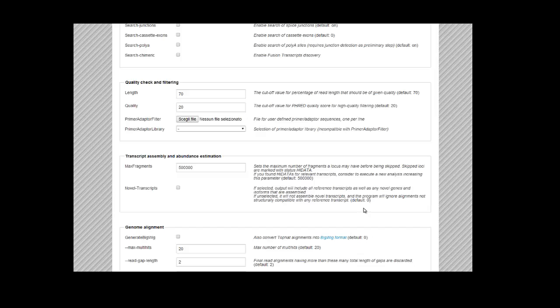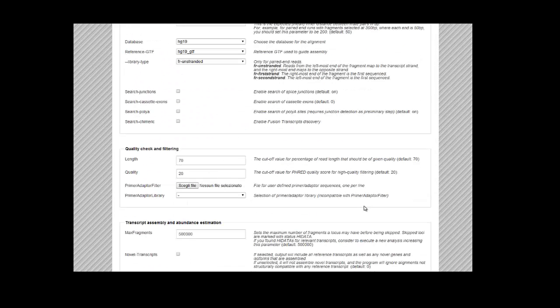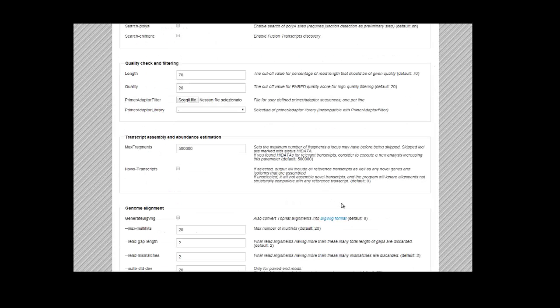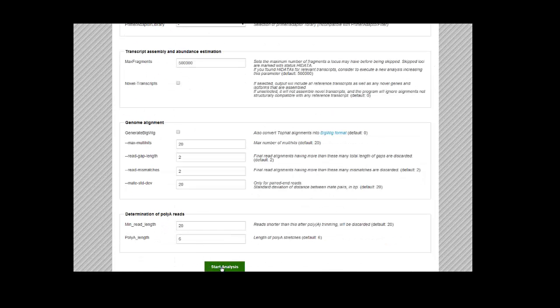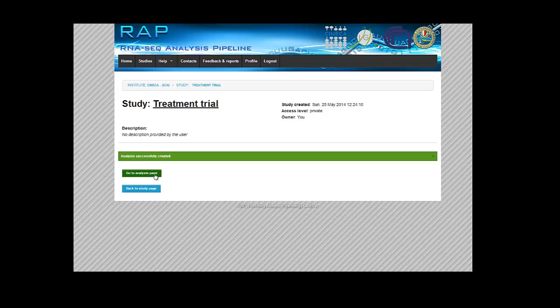Every single parameter is described here on the right side. And if you need further information on these parameters, you can find it in the specific software websites that are used along the pipeline, or you can check out our paper.